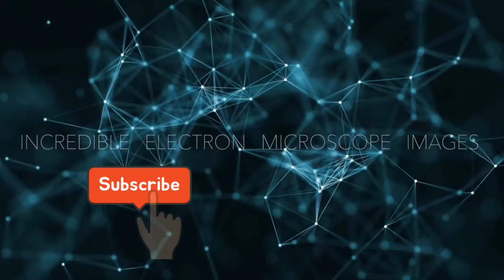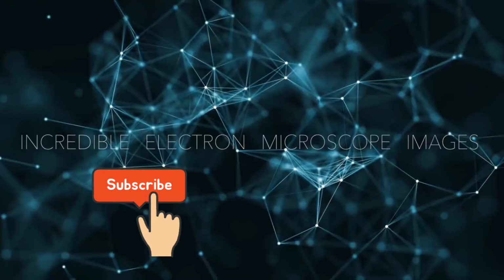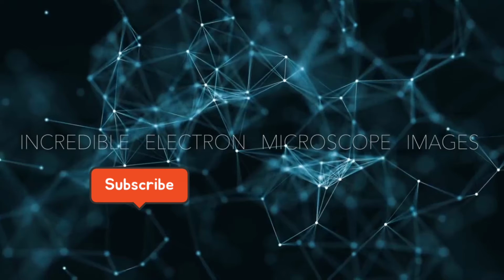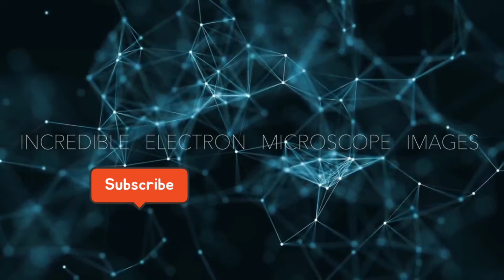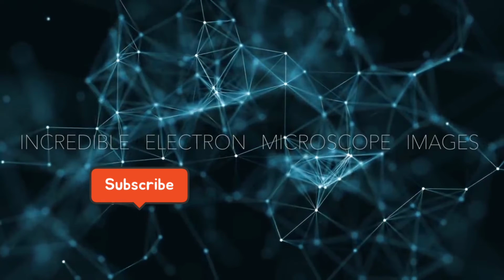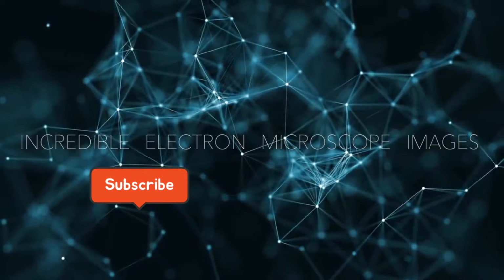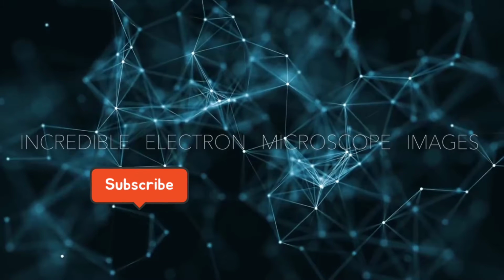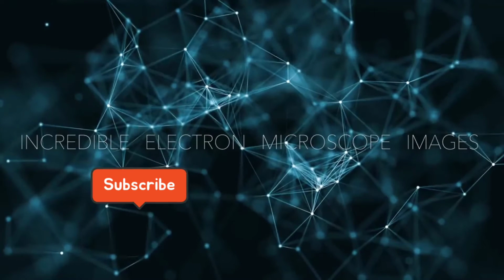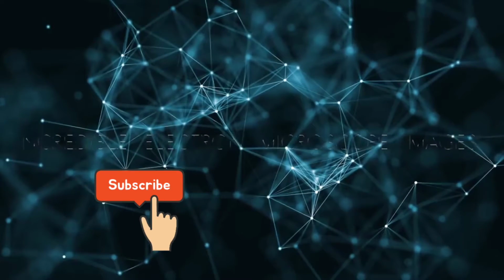Beyond the naked eye, there is a wonderful world going on around us we rarely get the chance to see. Technology, however, now gives us rare and incredible access to peer into this world and see it in detail like never before. Electron microscopes are the most powerful type of microscope, capable of distinguishing even individual atoms. Scanning electron microscopes in particular can magnify samples up to 3 million times. They produce 3D images of a sample by scanning the surface with a focused beam of electrons. Here are some of the most amazing images of what is too small to see with our naked eyes.